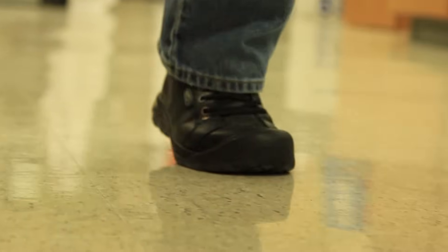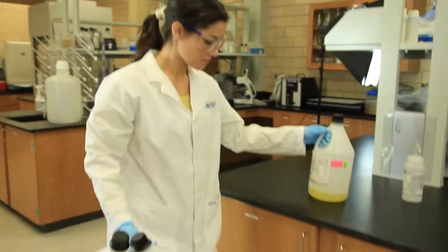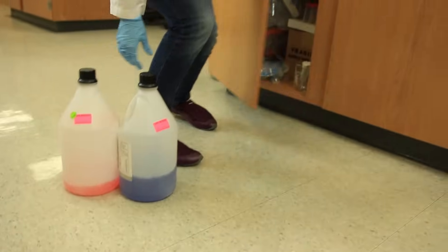Good housekeeping will prevent accidents too. A cluttered lab is a dangerous lab. Dispose of any trash or debris on the floor which could cause someone to fall. Never place any chemical bottles on the floor, not even temporarily.